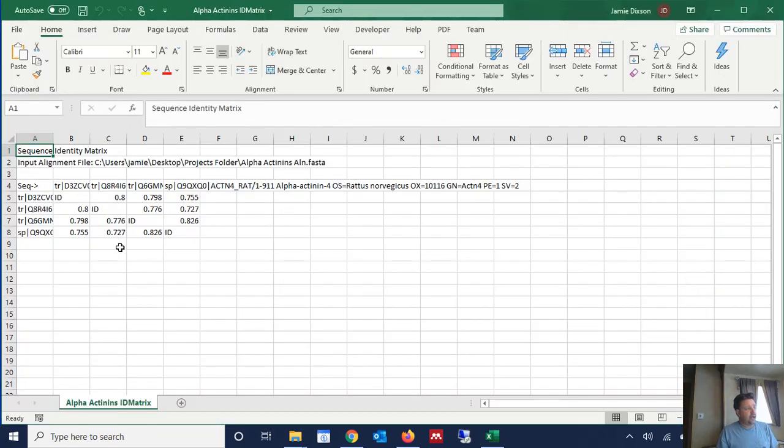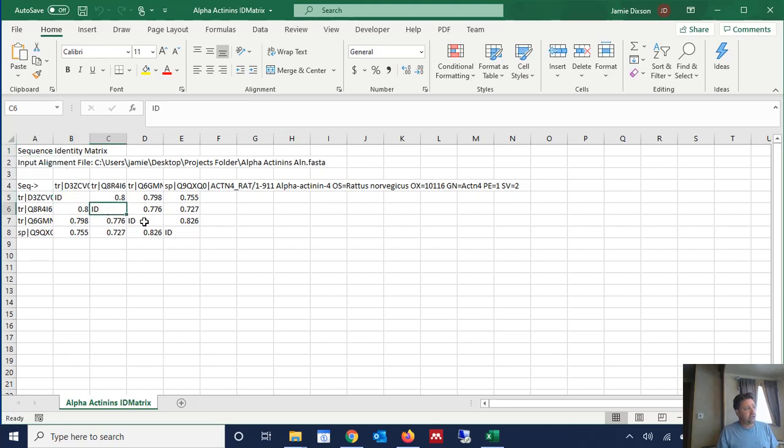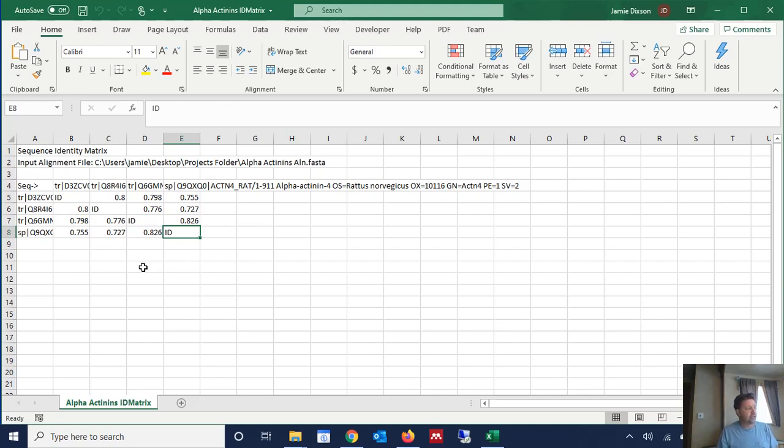And now we have the identity matrix right here. Of course the diagonal just says ID, that's the equivalent of 100% identity, or you could put a 1 there if you wanted to and it would be the same.